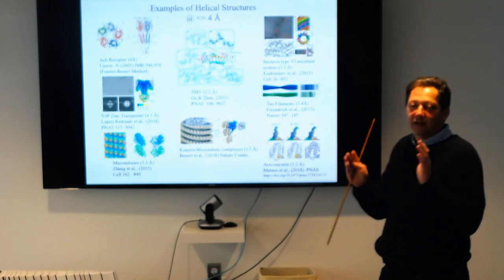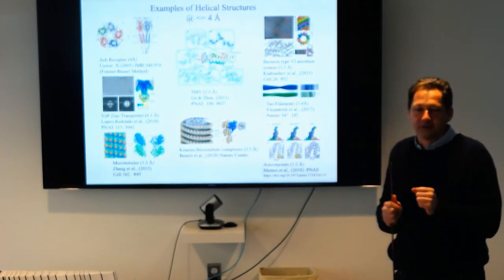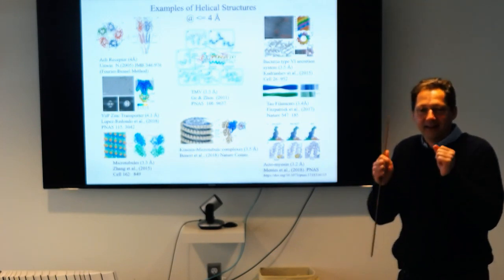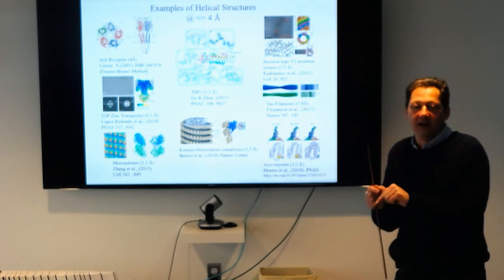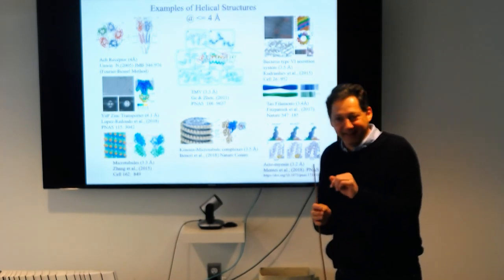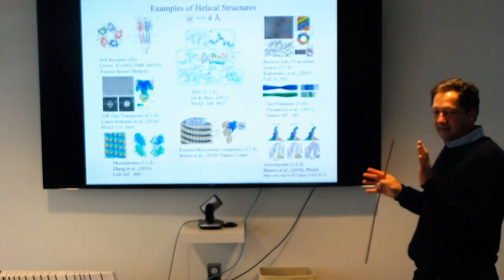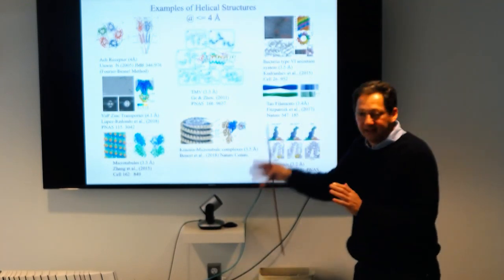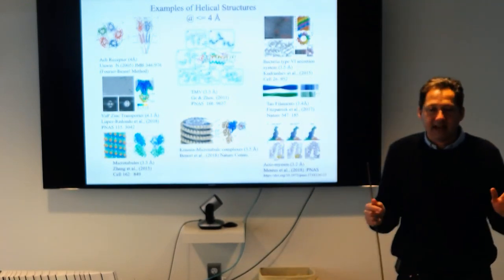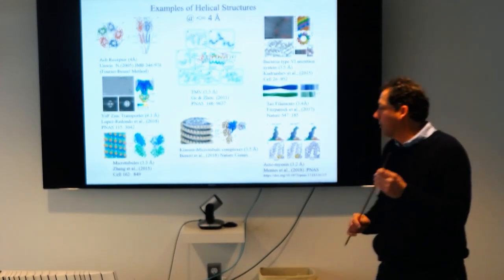I will say that if you say that you have 2.x resolution, you gotta see almost the hole in the rings of your aromatic residues. And I hardly ever see that in a lot of structures. But certainly below 4 angstrom, you see almost all the side chains. You're gonna make up what is the right rotamer and so on.